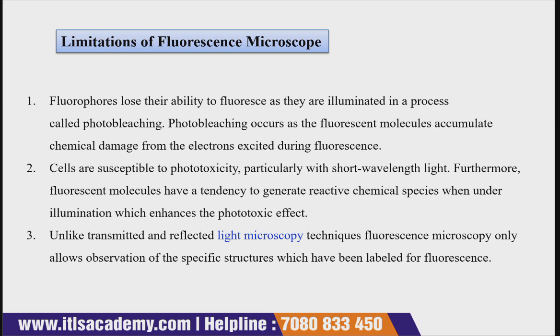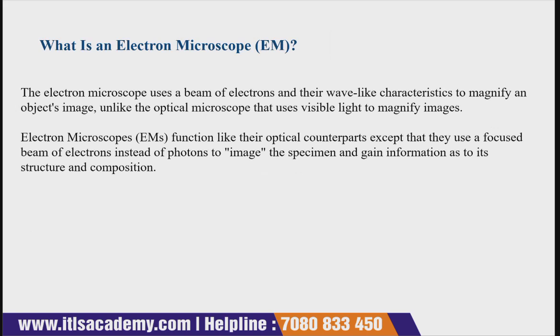Now let's quickly discuss what an electron microscopy is. So our next type of microscope, or you can say microscopy, is the electron microscopy. This is the most widely used type of microscope nowadays in different types of industries. Now let's quickly see and understand what it is.